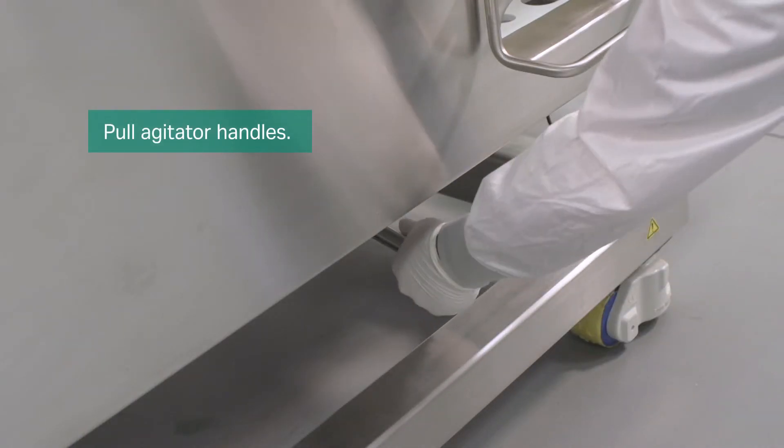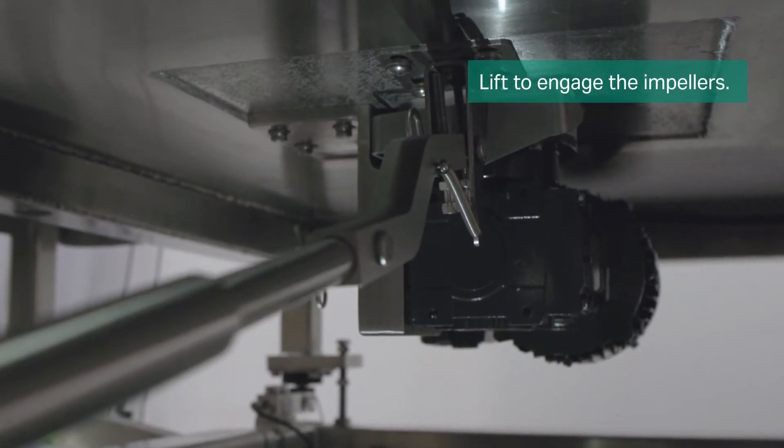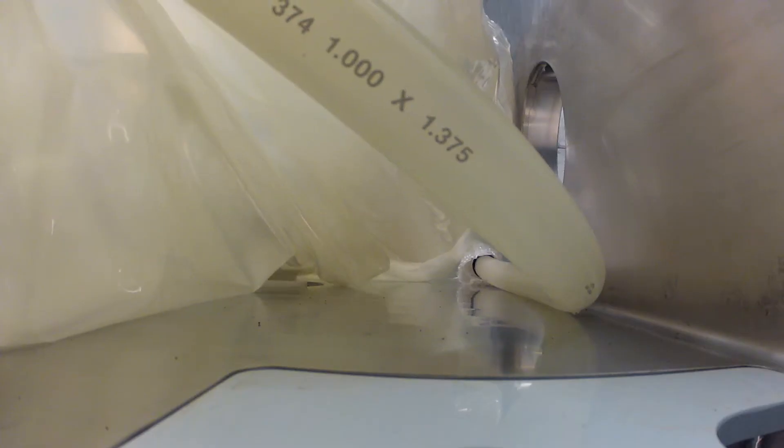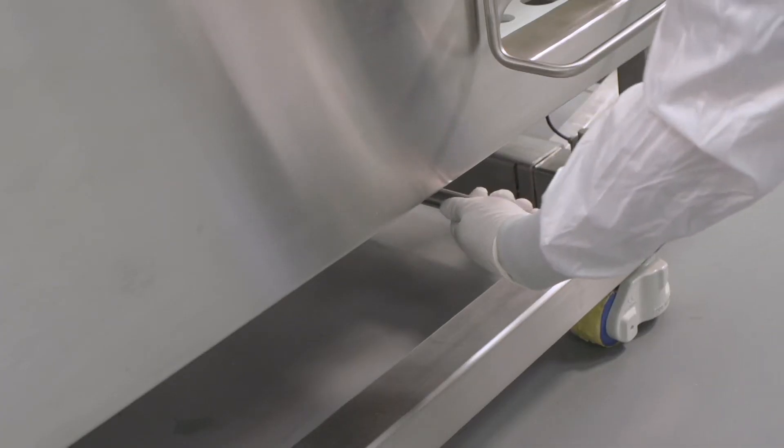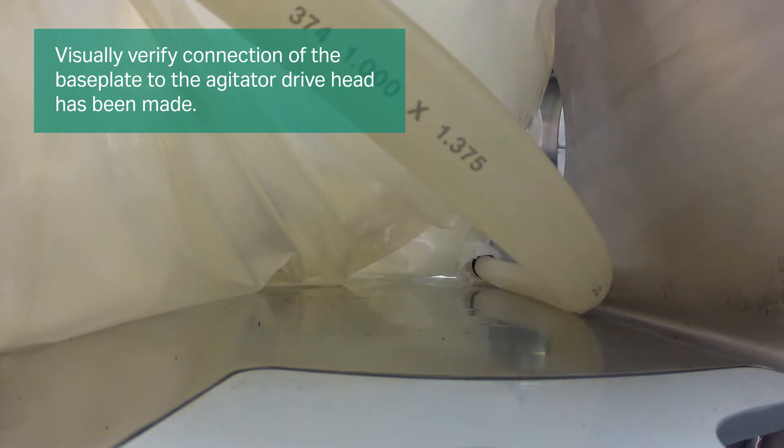To engage the impellers, pull the agitator handles completely from under the mixer and lift. Lower the protective collar. A click is heard when the base plate connects with the agitator drive head. Visually verify that the connection has been made.